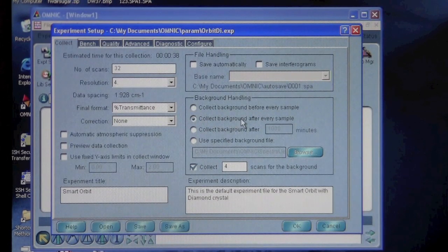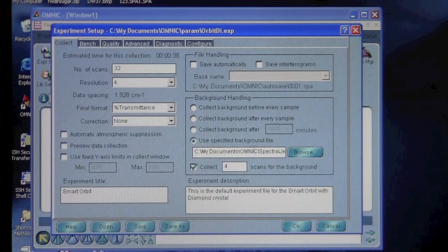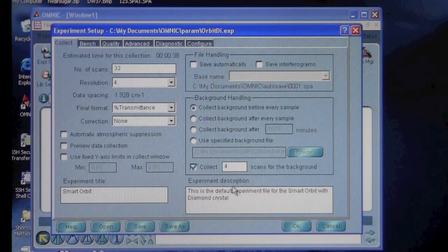We could also collect a background after the sample, after a specified amount of time, or use a file where you've saved the background separately. I'm going to leave it set to Before Every Sample and leave it with the default for scans.